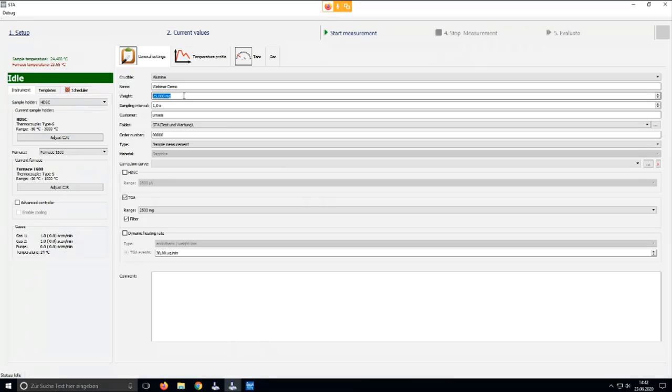The absolute weight of the measurement system and the sample can be quite huge or can be quite small, and therefore has to be weighed by hand and then typed in here, because the maximum change of mass is 2.5 grams or minus 2.5 grams. If you would exceed that, the system would not be able to measure that. Therefore, you have to type in the weight by hand.